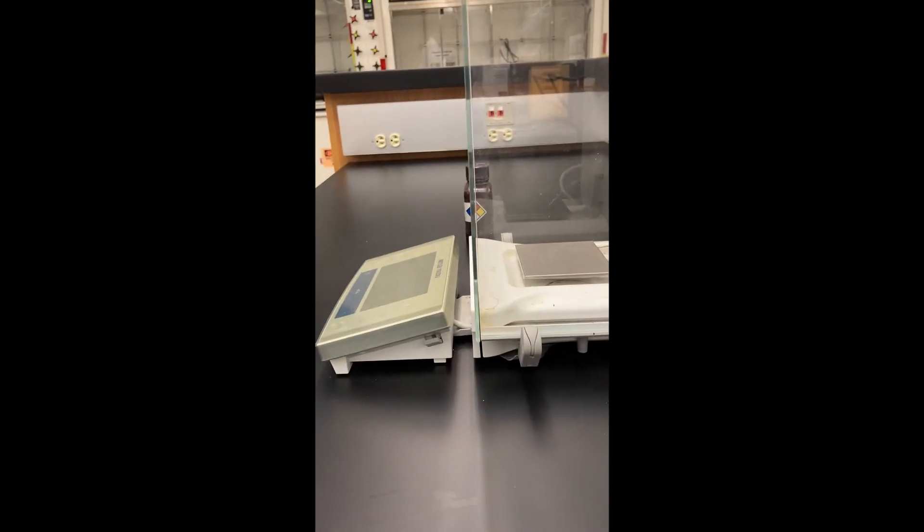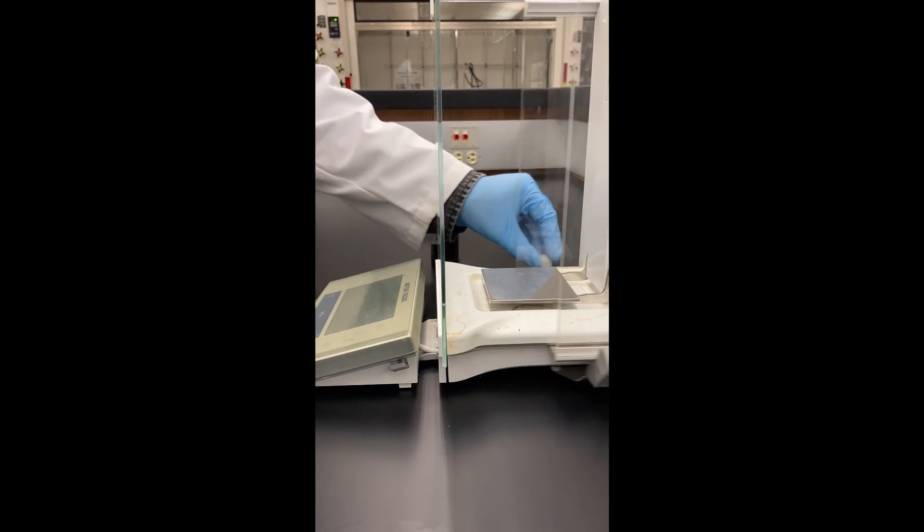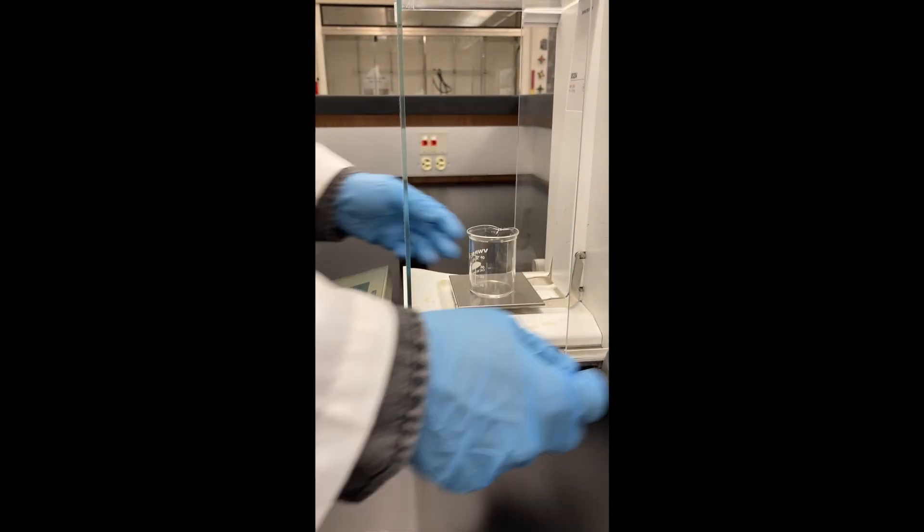Before you transfer your hexane layers to the 50 milliliter beaker, make sure you record the mass of it on a scale.